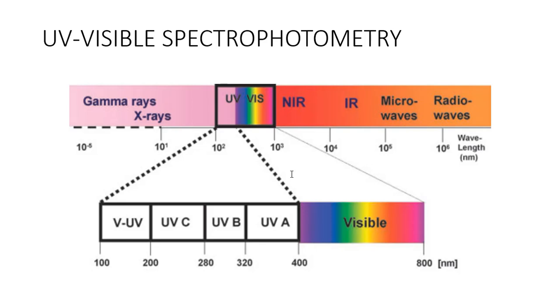So what exactly do we hold here? What is exactly the phenomenon? What is exactly the matter which is able to be analyzed through this component? So, what exactly are the factors influencing the absorbance of the UV light by a compound or analyte? So, we will go through it now.